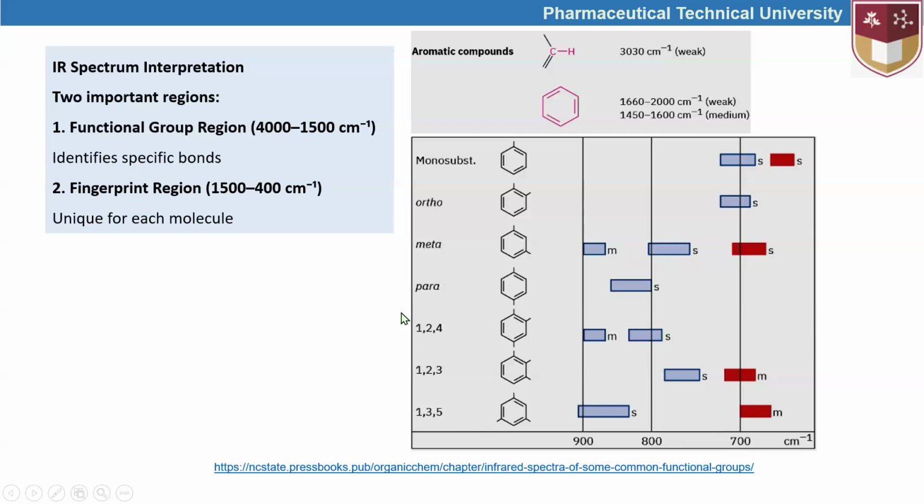Okay, in general, I would say that in aromatic compounds, compared to the monosubstituted derivatives, the addition of another substituent, or the formation of di- or trisubstituted derivatives, in general causes higher wave numbers of the infrared absorption.